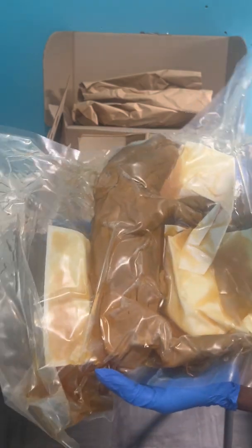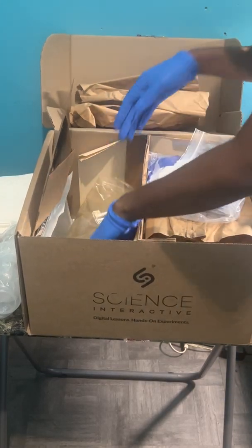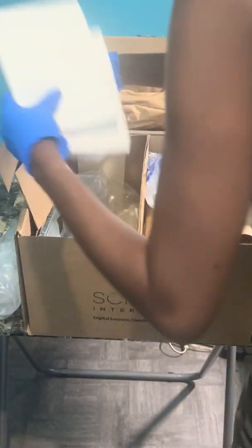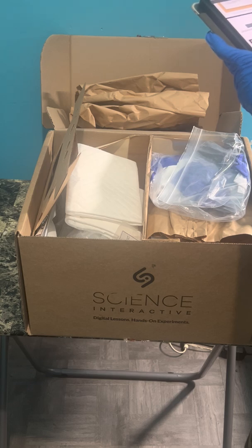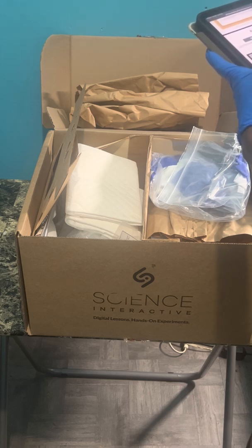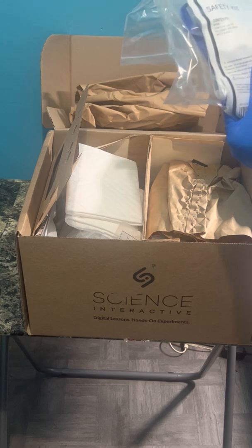If anyone wants to give this pig a name, I would like to give this pig a name. I don't want to cut it open. So we have a pig, brain, graduated tubes, underpads, beakers, tile, eyeball. Let's check those off the list: cylinder, cow eye, tray, pig, mask, cylinder. On the side we have the safety kit — there's an apron, exam gloves, a little bag, and some safety glasses.